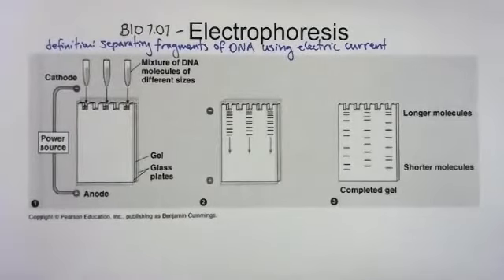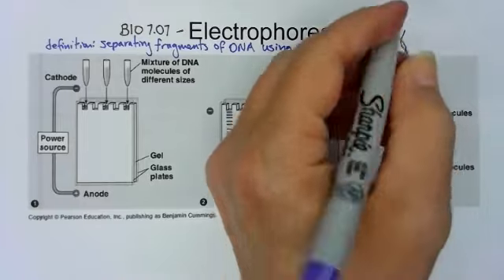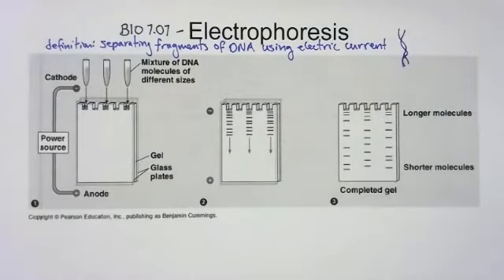Just focused in a little bit. It's about the same. Well, why fragments? Why can't we just run a whole piece of DNA? If you remember, DNA has these long shapes. We've got the double helix here. Why not just stick this in and separate the whole thing? Well, it turns out the one piece of DNA will all run the same length. So when we talk about the reason why these separate, you'll see why we have to break them into pieces.